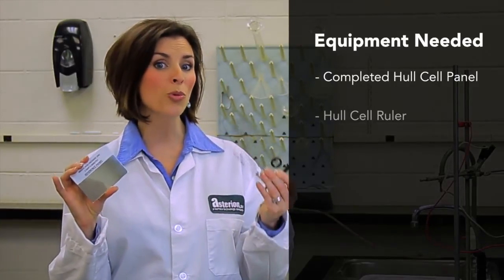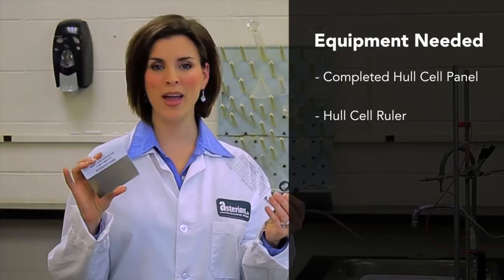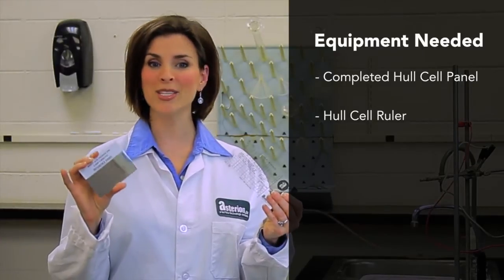Here's the equipment needed to interpret a hull cell panel. After the hull cell panel is plated in the hull cell, the completed hull cell panel and a hull cell ruler are required to analyze the hull cell panel and, correspondingly, the test plating solution.